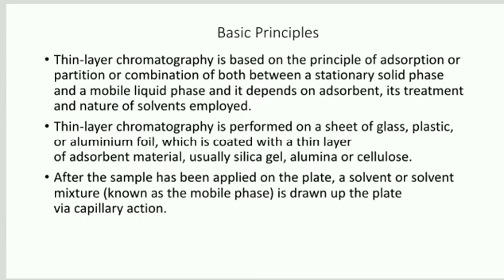Thin layer chromatography is based on the principle of adsorption or partition or combination of both between a stationary solid phase and a mobile liquid phase, and it depends on the adsorbent, its treatment and the nature of solvents employed.